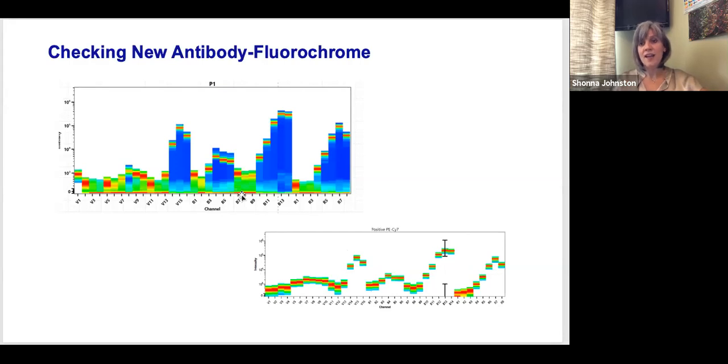My guess is that the antibody had degraded quite heavily already. So they were able to send that back to the company with the information that we got from here, and we got a new antibody, which was great and way improved on the first one.